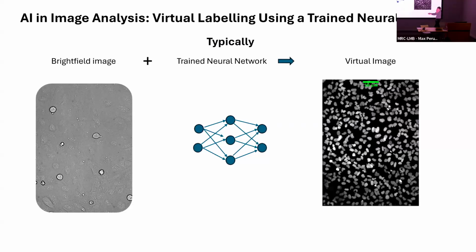So I have to train this network. I have to basically make a real DAPI image sample and a bright field image, and use those pairs of samples to do the training. Then when I'm on the microscope, I just collect this bright field image and the network will generate what it thinks the equivalent DAPI would look like. This is very, very handy in live imaging.